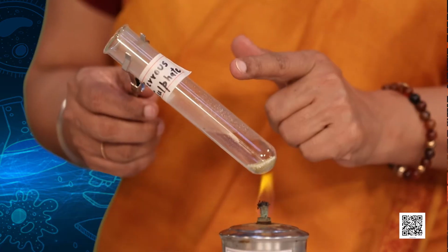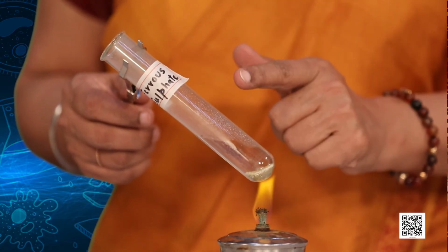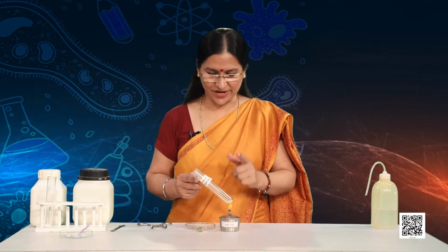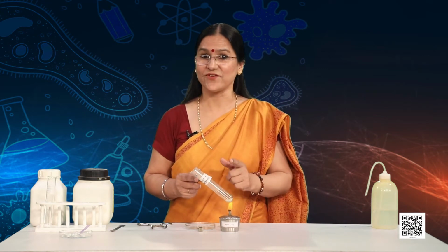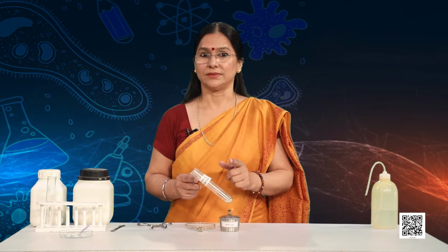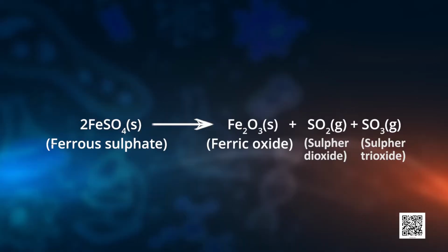Now friends, can you see these water droplets on the inner surface of the boiling tube? From where have these water droplets come? Well, the ferrous sulfate crystals, that is FeSO4.7H2O, lose water when heated, and the color of the crystals changes. This process can be represented by the chemical equation you can see on the screen. Ferrous sulfate is shown decomposing into ferric oxide, sulfur dioxide, and sulfur trioxide. Ferric oxide, as you can see, is solid, while SO2 and SO3 are gases.